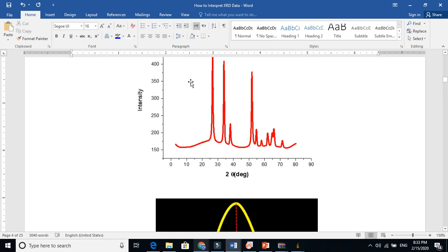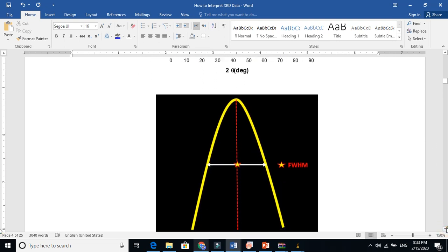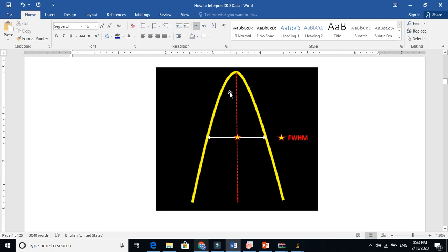This is the XRD graph. If I zoom the peak here, it will look like this. When I zoom it here, basically full width, this is the full width here, the white arrow. And I draw the line here and I cut that line at exactly the midpoint. Half means 50.